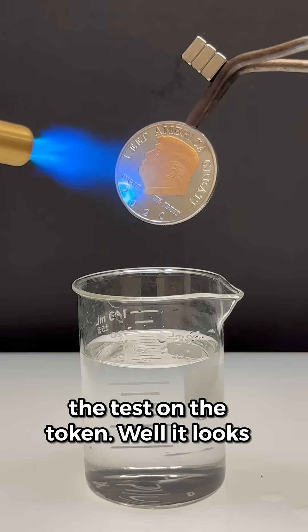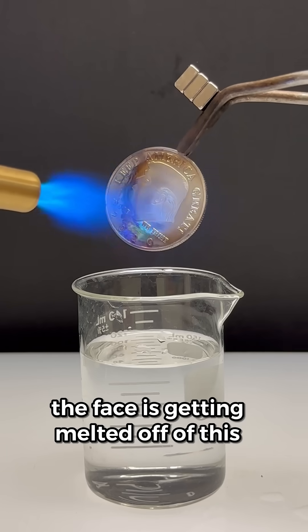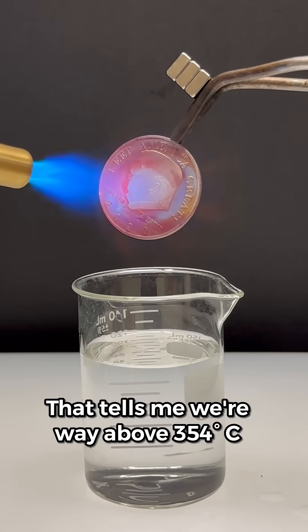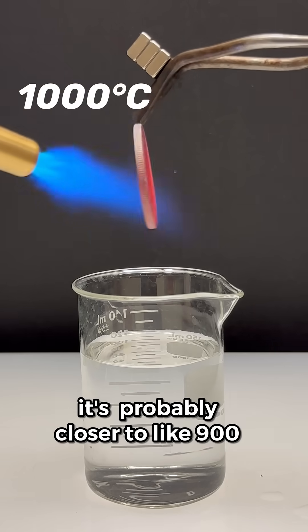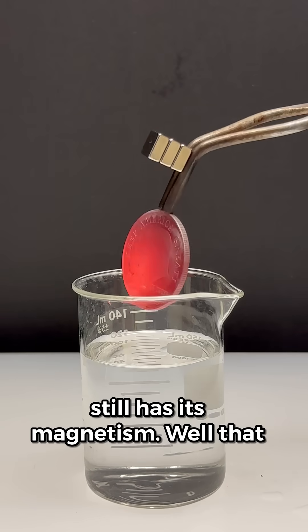Let's get back to the test on the token. It looks like I'm able to heat this for a pretty long time. In fact, the face is getting melted off of this thing. It's starting to glow an orange color. That tells me we're way above 354 degrees Celsius, probably closer to like 900 or 1,000 Celsius. Sure looks like, despite the liberal heating, this thing still has its magnetism.